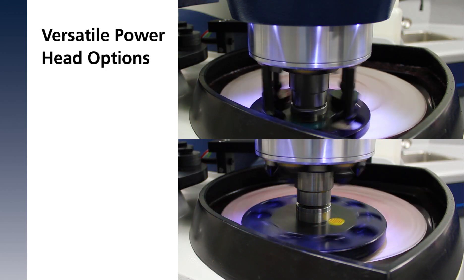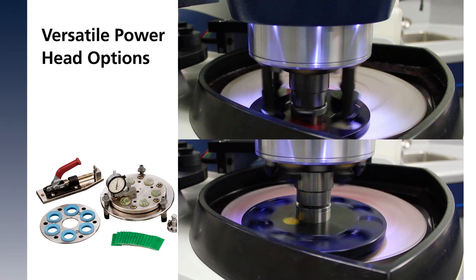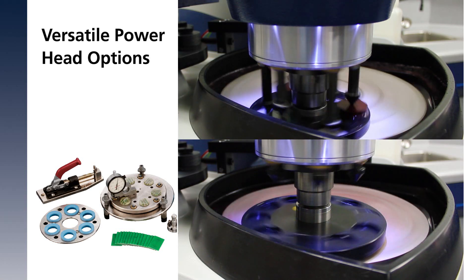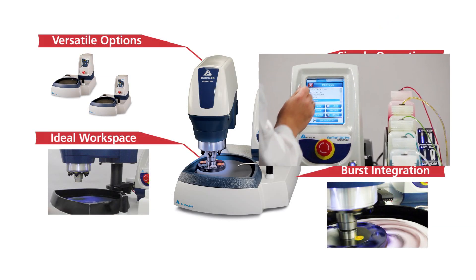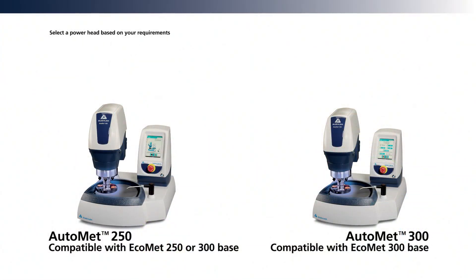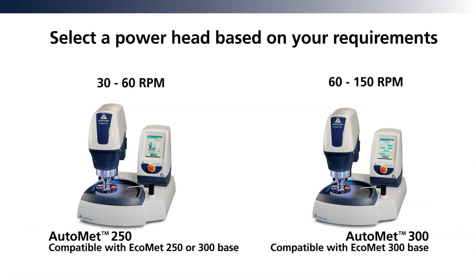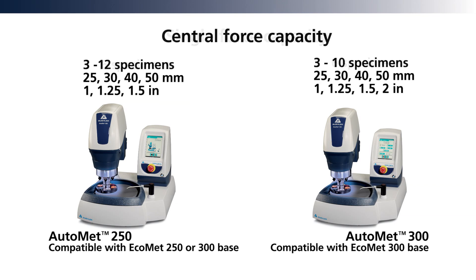Both powerheads accept single and central force holders, as well as specialty accessories for targeted grinding or glass slide holders. The single and central force operation variable speed reversible powerhead stops the specimen holder in the same location each time.